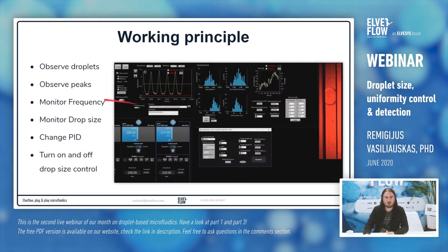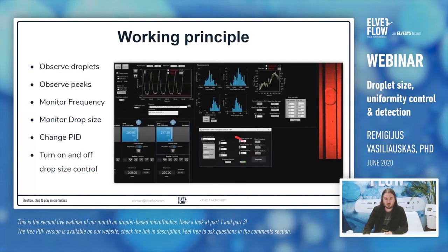The software looks like this. Here you can observe droplets in a live view and observe the peaks for every droplet. If you see something not right, you can change it. You can monitor the frequency of droplet production and see how it changes over time. You can also monitor droplet size and get statistics, change PID parameters if the system reacts too slowly or too fast, and turn the droplet regulation on and off.